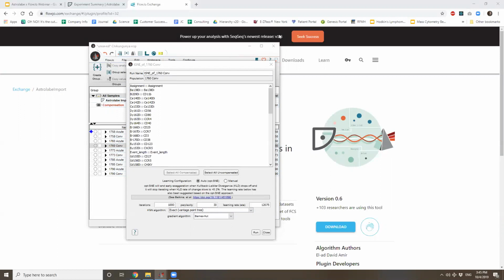Yeah, so Barnes-Hut has always been the traditional gradient descent off of the first proposed method. It moves from one step to the next throughout the iterations, trying to make the algorithm fit a little bit better. The fast Fourier transformation is just a speedier gradient descent tool to accelerate to larger transitions when needed and smaller transitions when that is more appropriate.